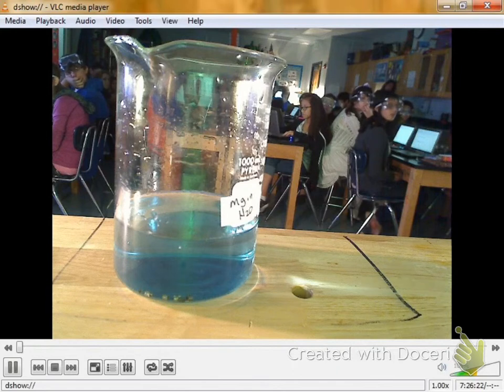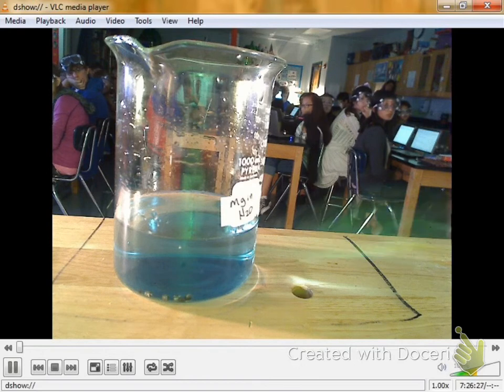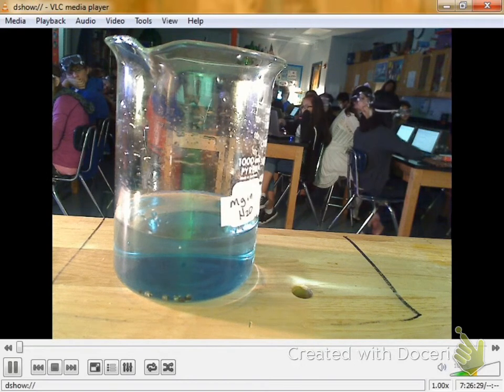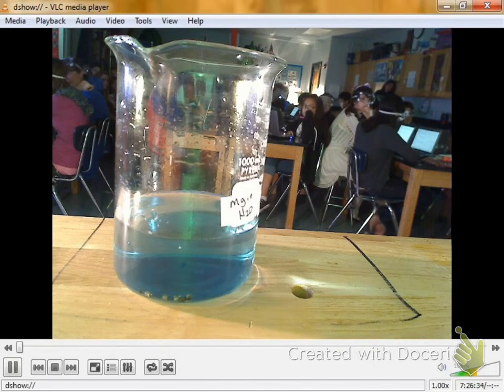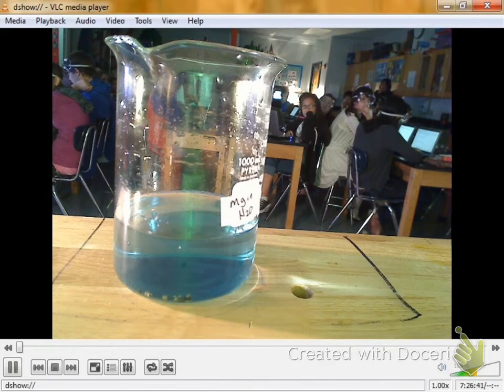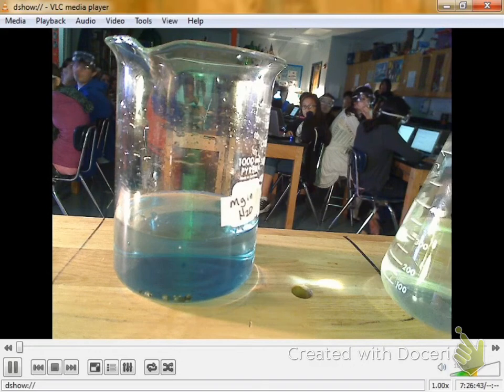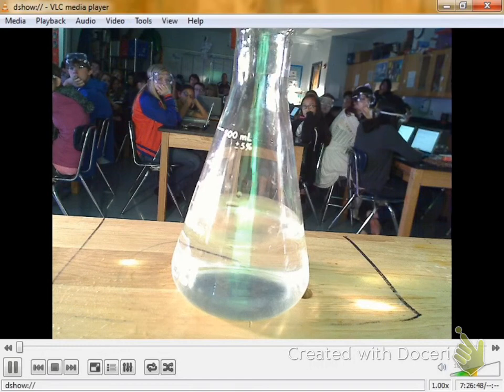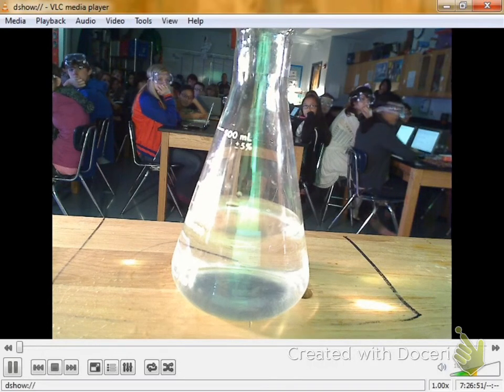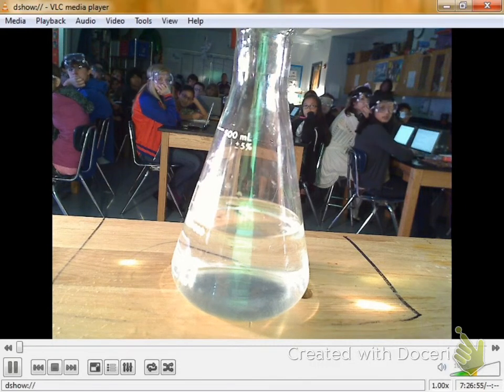It's blue, like it is here, when it's neutral or has a pH of 7. And we hope that our drinking water has a pH of 7. We want it to be neutral. If it was acidic, it would turn pink, and if it was basic, it turns yellow or green. Here, I'll even give you a little, since you're my last class. Here's the hydrochloric acid that I've been using all day. Notice right now, it is clear. I put in the blue cabbage juice.